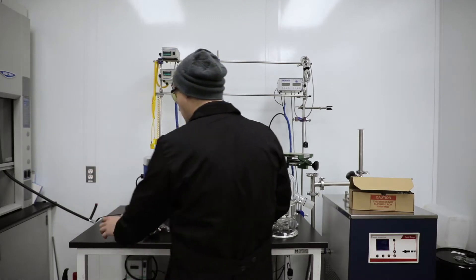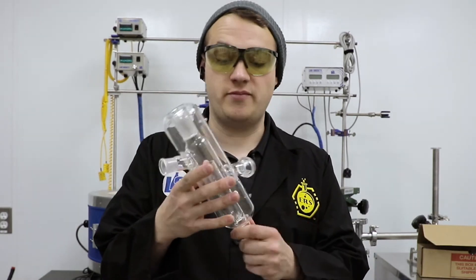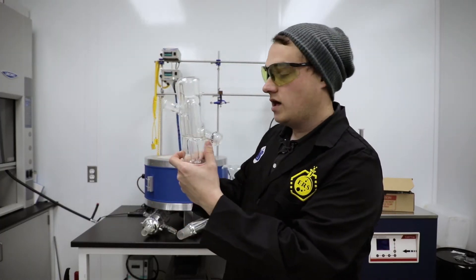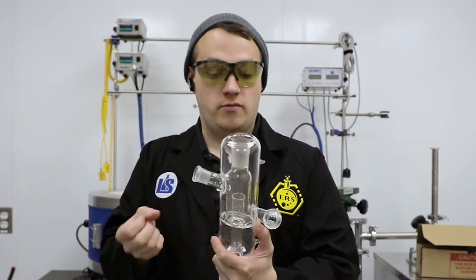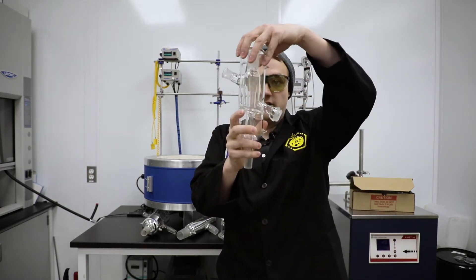Where the high-efficiency heads come into play — starting all the way back from when we first tested these things, prior to filing the patents — here we have the first high-efficiency distillation head that we ever produced. This one was the original prototype. The whole idea behind this distillation head was that rather than having what comes out of our fractional column have to exit out of a hole that's off the side, why not have anything that gets to the top of the column be able to condense? So you can see our up-tube is exiting into this enlarged, basically pre-condensing chamber.